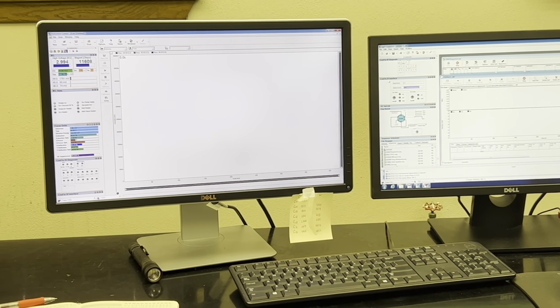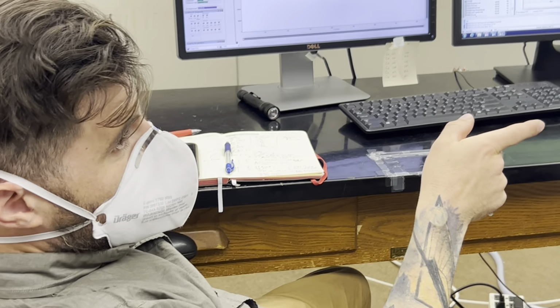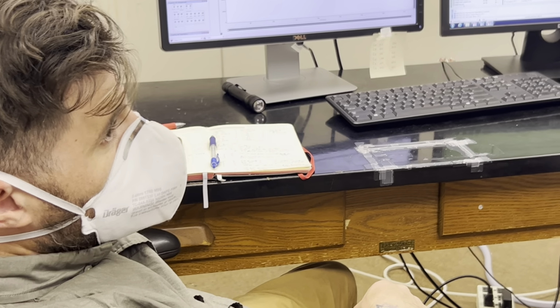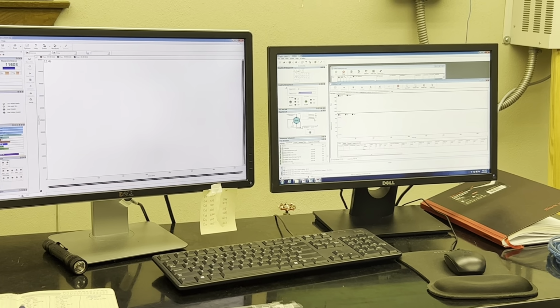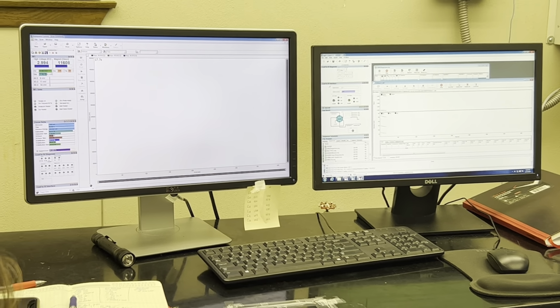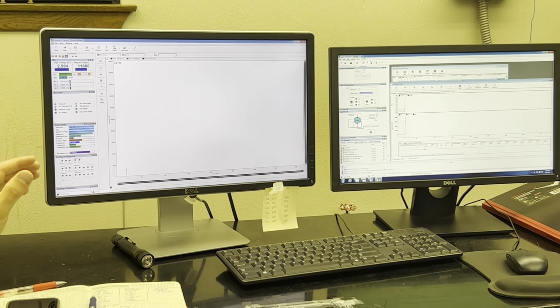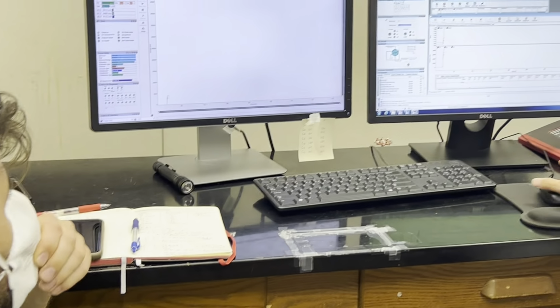Both needle valves open, both heater valves open, as long as the gas vent is hooked up to helium. Yes, helium is on, to the gas bench. So I'd open up both needle valves, keep the filament on, keep the source on, and turn on all the heaters and just let it bake out the whole system over the weekend.